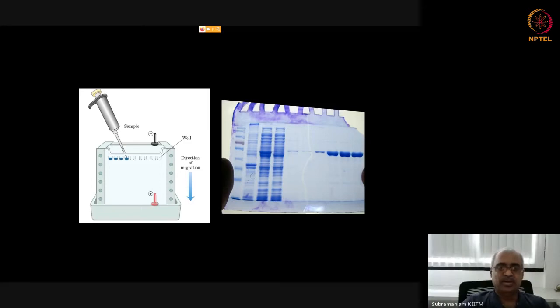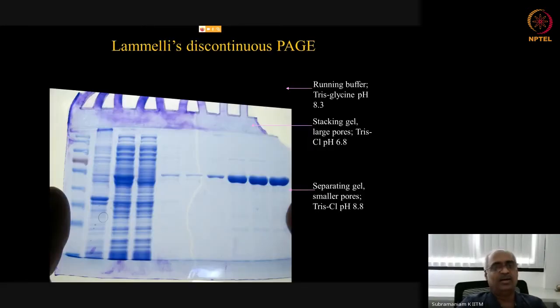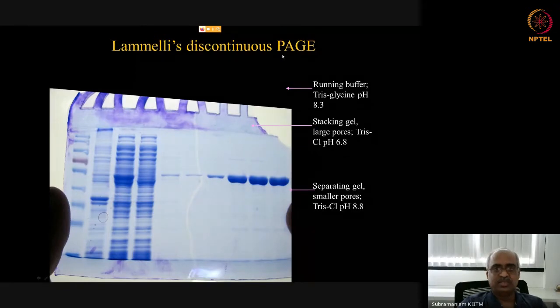So we do a certain modification to this basic simple gel such that these two are no longer an issue. The shape is made uniform for all proteins, and similarly charge is also made uniform for all proteins. And that modified version is called SDS-PAGE. Okay. So here I'm going to explain that in detail. And before I go into SDS, I want to explain one more detail about this basic polyacrylamide gel. So this PAGE stands for polyacrylamide gel electrophoresis.